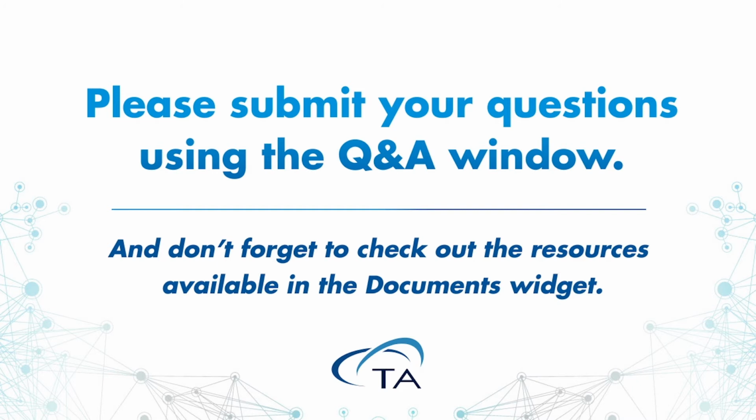Okay, great. Thanks, Dial. Next question. Is the TAM4 okay for using gel samples? And the answer to that is yes.